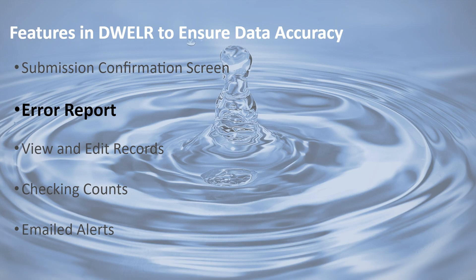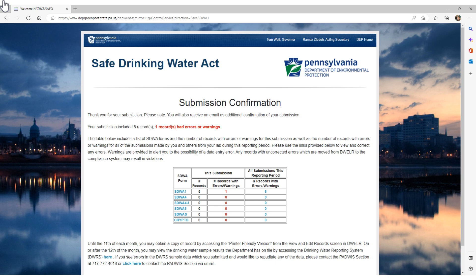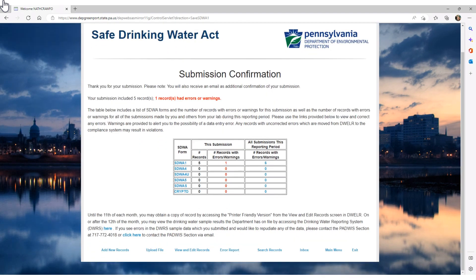The next DWELLR feature we will talk about is how you can view your error report to see what the issue is with the data you submitted into DWELLR, and then how to correct the error. From the Submission Confirmation screen, we see that we have one record with an error or warning for the data we just submitted. Scroll down to the bottom of the page and click the Error Report button.